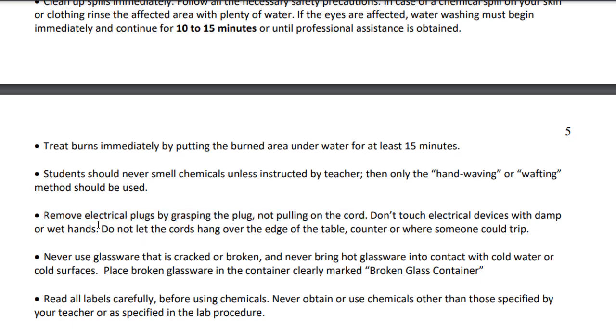Plus, don't touch anything with wet or damp hands. This is a test question. It's an easy one. Water conducts electricity very nicely if it's got stuff in it, and you can get electrocuted if you have wet hands when you're touching electrical devices, so don't do it.